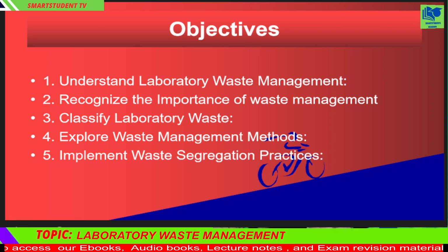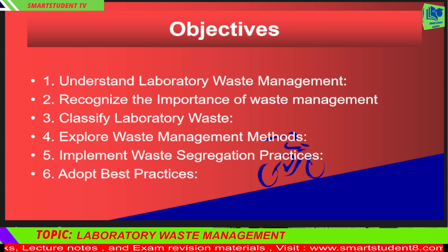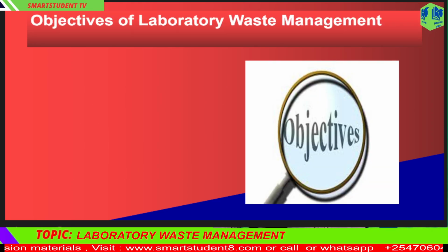5. Implement waste segregation practices. Learn the correct ways to segregate different types of waste using appropriate disposal bins. 6. Adopt best practices. Develop skills to incorporate waste management best practices in day-to-day lab activities. Objectives of laboratory waste management. The objectives of laboratory waste management are aimed at ensuring safety, compliance, and sustainability within laboratory environments.